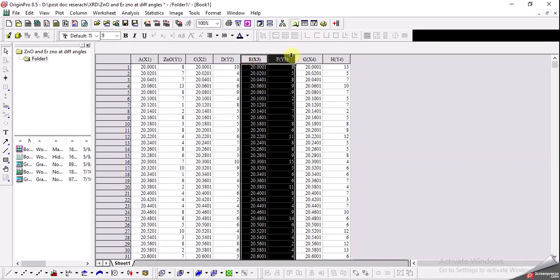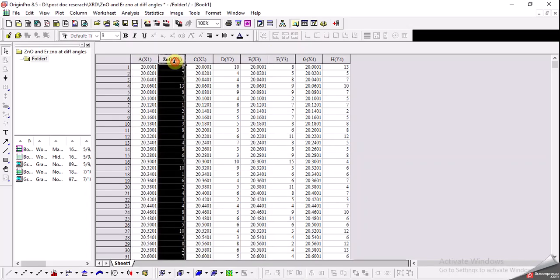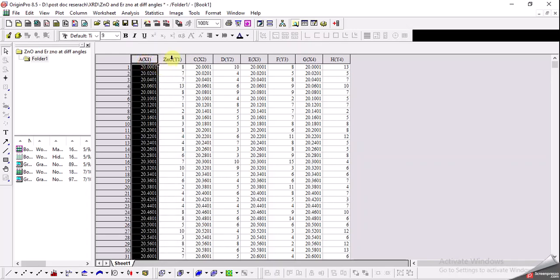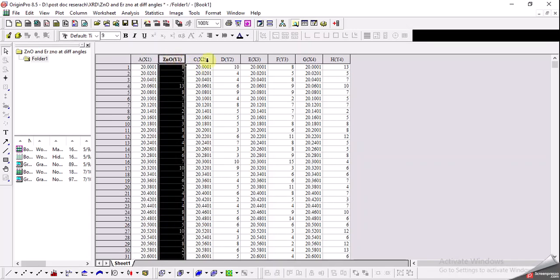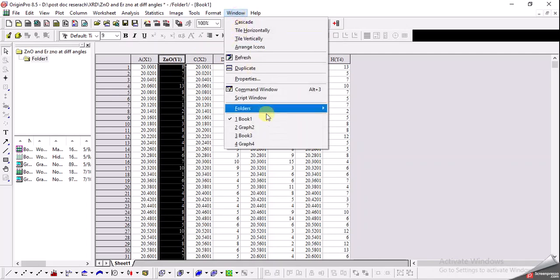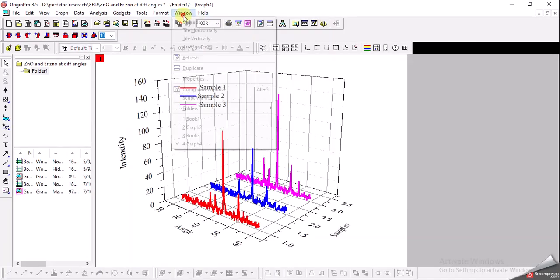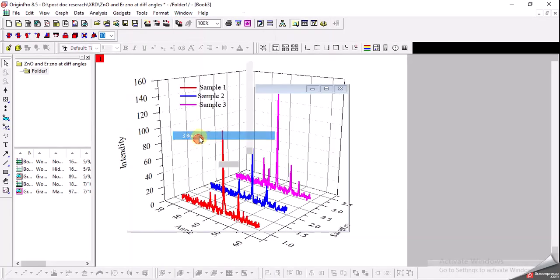In a normal 2D graph we require the x-axis and the y-axis, but if we want to make a 3D graph of the same data, we will require x, y, and also the z-axis. So what I did is I transformed this data into this new format.